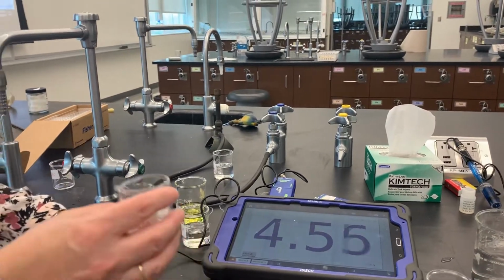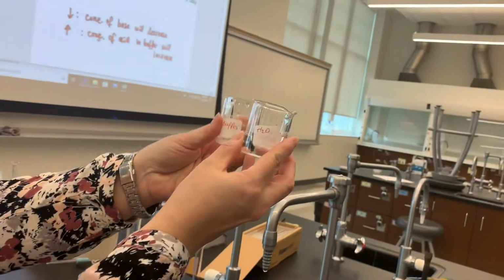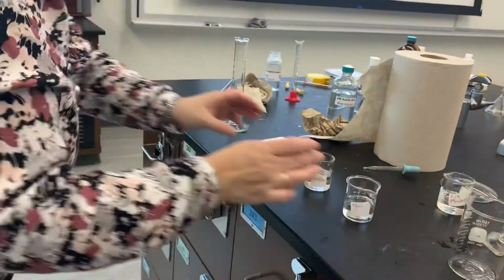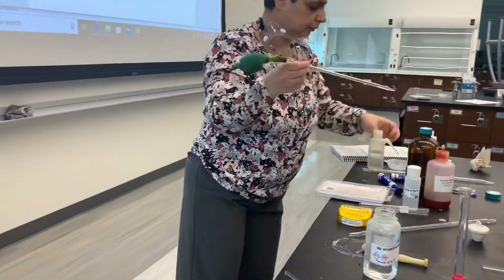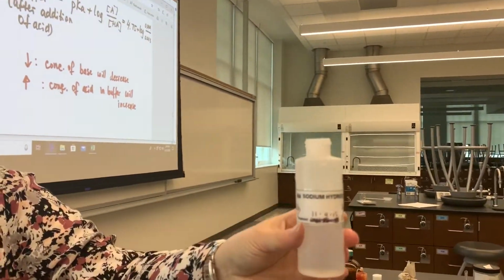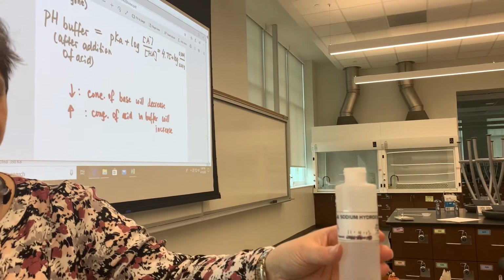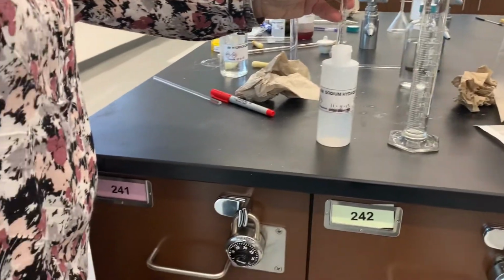So I'm going to take this buffer beaker and this water beaker, 25 milliliters of buffer in this one, 25 milliliters of water in this one, same volumes, different solutions. I'm going to set them right here. And in this bottle here I have 6 molar sodium hydroxide. So next we're going to add 0.5 milliliters of 6 molar sodium hydroxide to each beaker containing buffer and water, and we're going to then measure the pH.